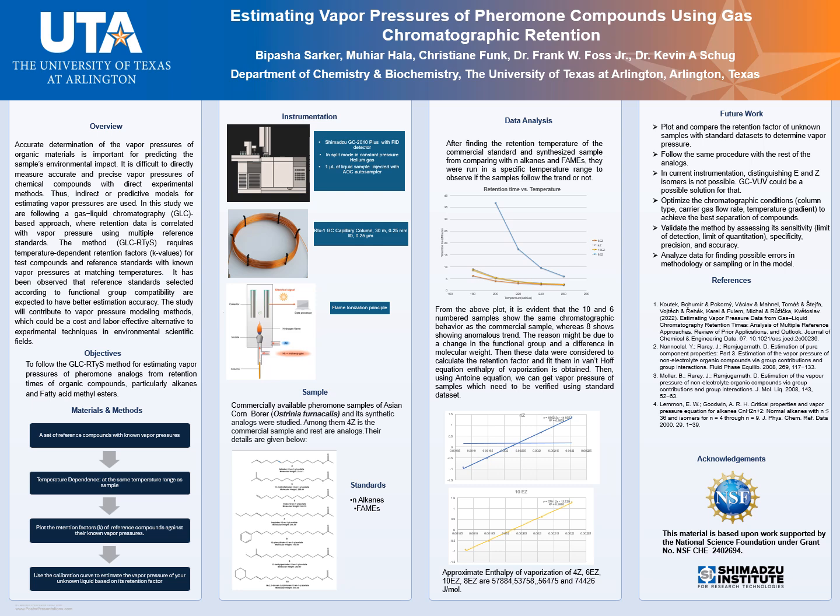In instrumentation, we are using GC-FID, and we are using an RTX-1 column, which is a simple boiling point column. It is used because it is the most non-polar column, so interaction with the stationary phase will be minimal according to our sample type. And we are using split mode and constant pressure. Helium is used as the carrier gas.